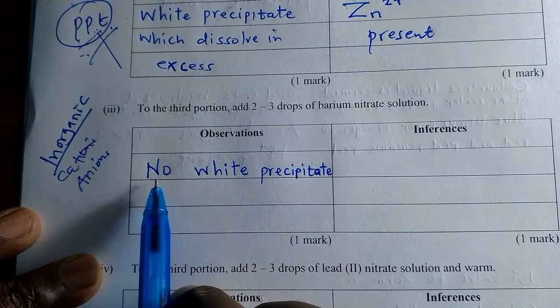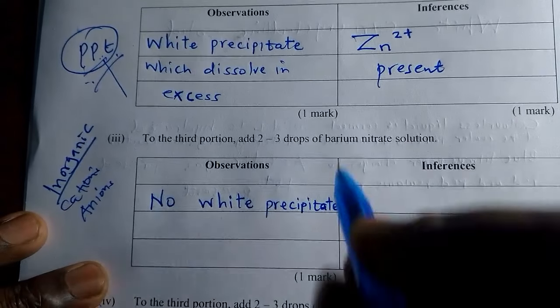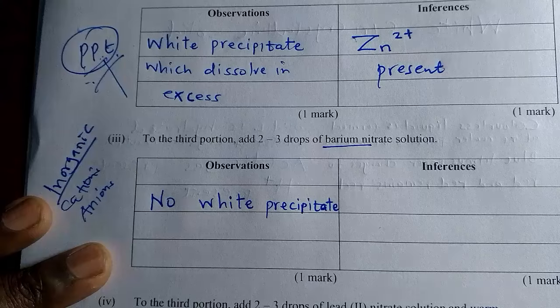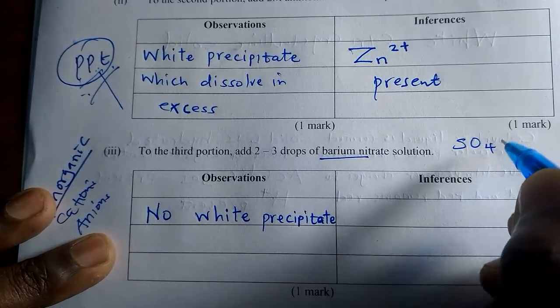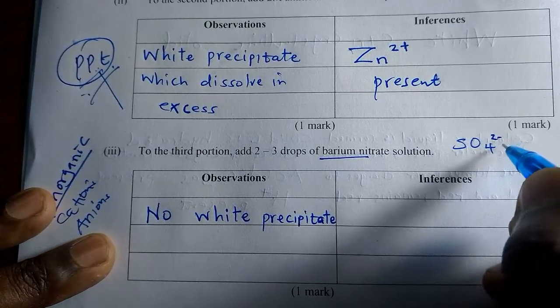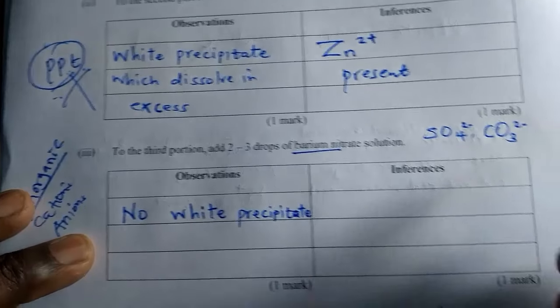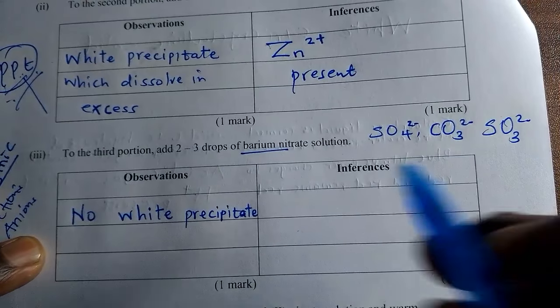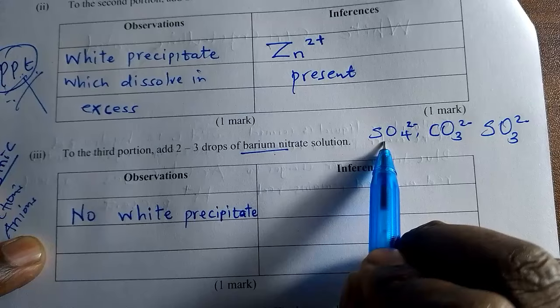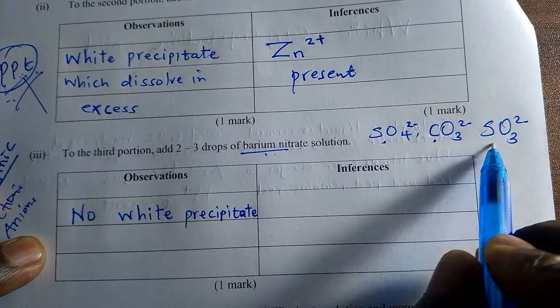And we are adding barium nitrate. Barium forms a white precipitate with the sulfate, with the carbonate, and the sulfite. So barium sulfate is a white precipitate, barium carbonate is a white precipitate, barium sulfite is a white precipitate.